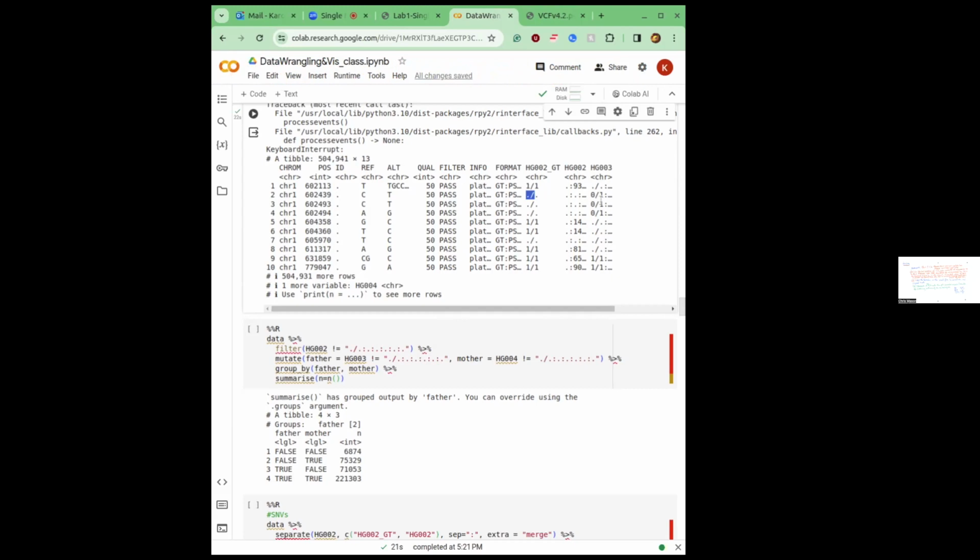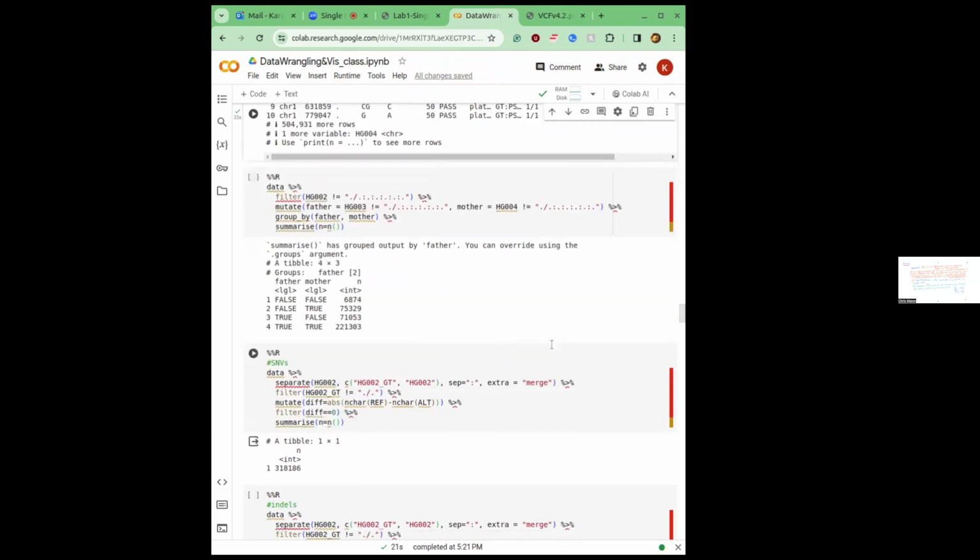Here you can see that in sample number 3 there is this variant, and it's not present in sample number 2, and sample number 4 was somewhere there as well. Why don't they use 0/0 here? Because 0 refers to the reference allele. So this is basically an equivalent of NA. But if you have NA, then when you parse this file, if you did not put it there on purpose, there's an error. All right, this is how we work with tidyverse.